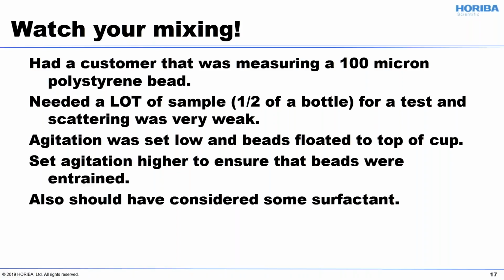And so I looked at what they were doing, and you can look in the sample bath and see that the beads were floating to the top of the cup because their agitation was set too low. And so once we set the agitation higher, we could ensure the beads were well entrained. I wanted to consider some surfactant, but because of the way their internal procedures worked, that would be quite a lot of grief for them paperwork-wise, and so they didn't do that. But that would have been the next step, is to really add something to ensure the particles were completely wetted.